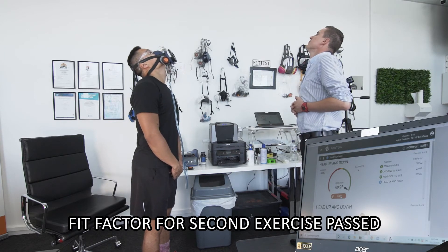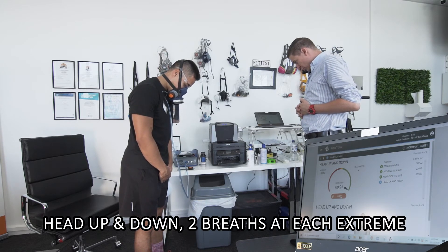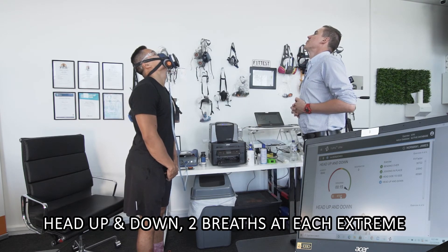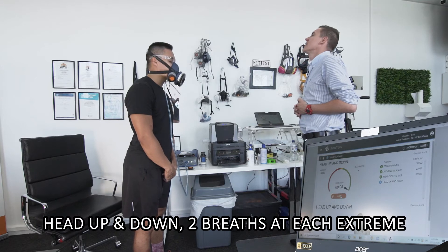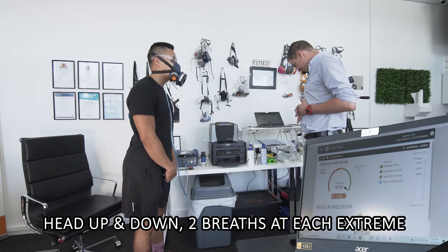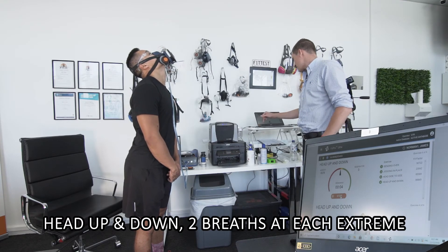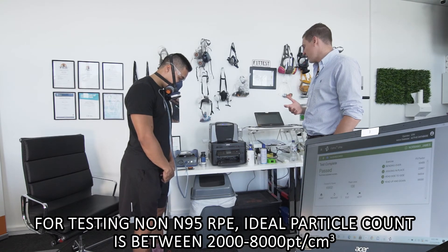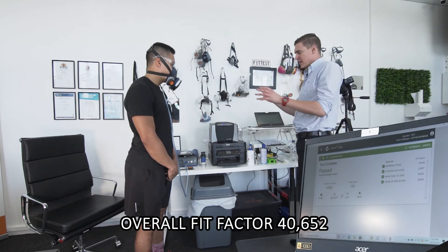Now head up and down — all the way up, two breaths. And then all the way down, two breaths. And up again, two breaths. And all the way down, two breaths. And up again, two breaths. All the way down again, two breaths. Keep going for the last eight seconds — we're purging now, so we're sampling air on the outside of the mask. Still consistent — there are 6,800 particles. For testing non-N95, you want it to be between 2,000 and 8,000 particles. James, you've passed overall with a score of 40,652. If you want to take a seat, mate — that's really good.